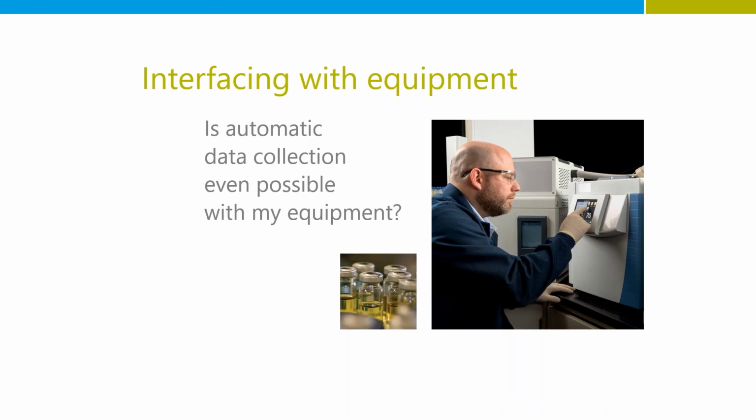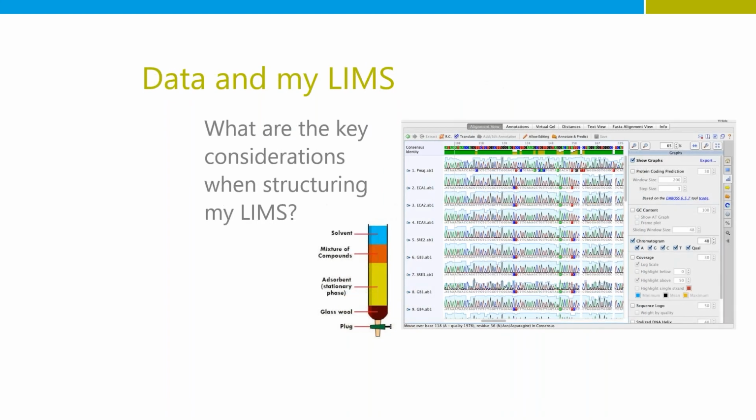That's awesome. Perfect. Thanks, guys. You both touched on the data entry process with a laboratory information management system, or a LIMS. Many folks, I'm sure, are aware of that, or in general, just a database that's going to house that information and store it and keep record of it so that you can report on it downstream. So, Bill, I know you've worked with these types of systems pretty intricately in the past. You want to talk very briefly on the key items of setting up a LIMS system or a database, just to make sure that it meets your organizational requirements?